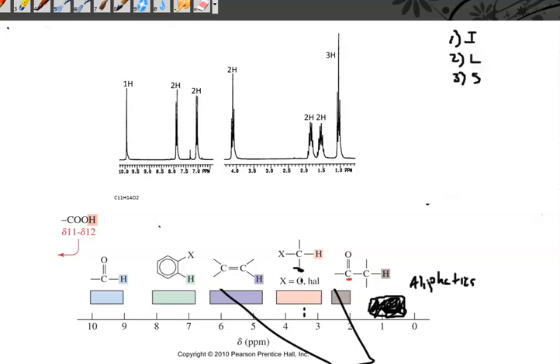We're distinguishing the peaks. So again, think about Pascal's triangle. Remember, if you have an even number, odd number, just look for the blips. I'll give you this hint. In this region right here, in the 7 to 8 region, don't worry about the splitting pattern. Just look at how many hydrogens total are in that group. Just worry about the splitting at the 4, at the 1.5, and the 2 and the 1.